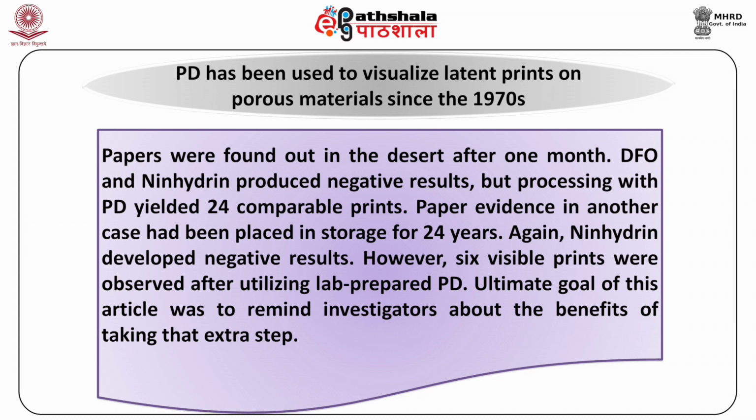The ultimate goal of this article was to remind investigators about the benefits of taking that extra step, whether one chooses to purchase the kit for convenience or the individual chemicals for cost efficiency. Physical developer could reveal the one latent that solves a case.